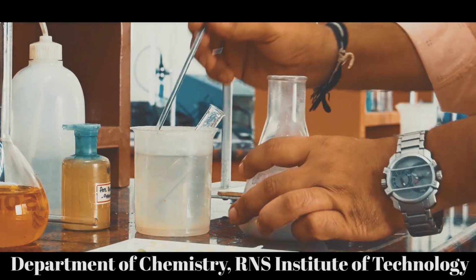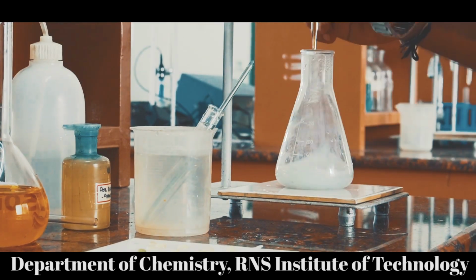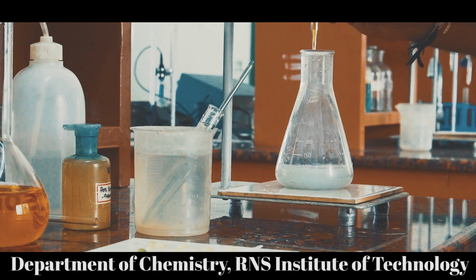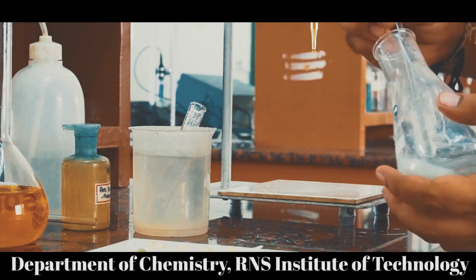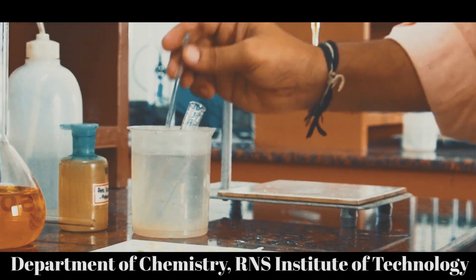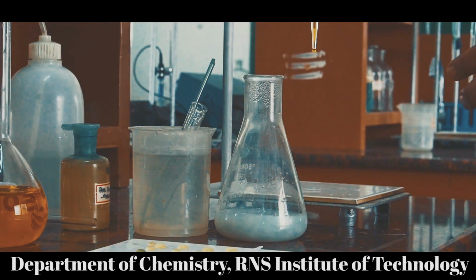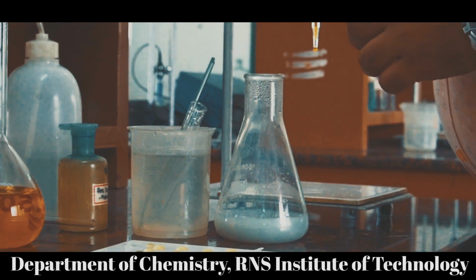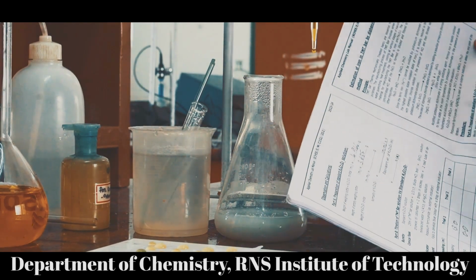So here, if you feel it is changing a little bit, you can go further. We just have to check whether we have reached the end point or not. So you can add 2 drops. See, the indicator droplet fails to change its color, right? So that confirms the end point. So now this time very accurately we can get to know.